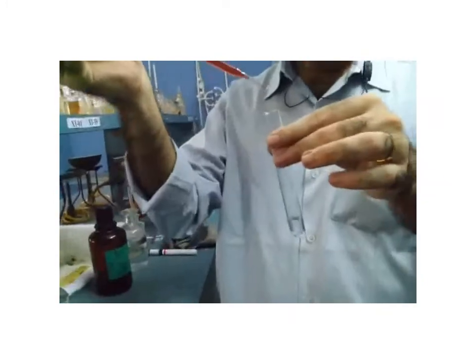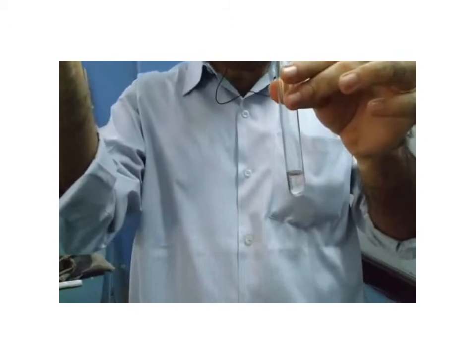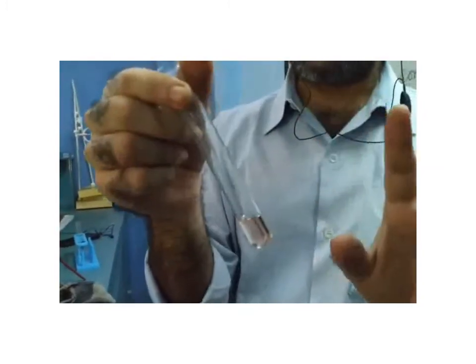I've added 1, 2, 3, 4, 5 and 6 drops of phenol. What happened? Nothing. It is only showing the color of phenol itself, nothing else.